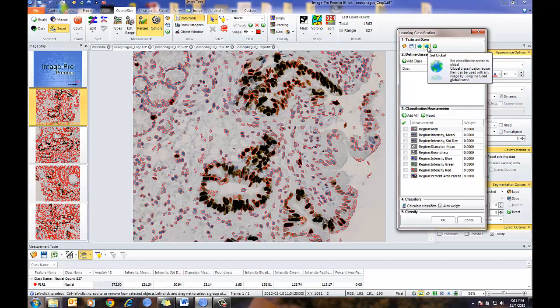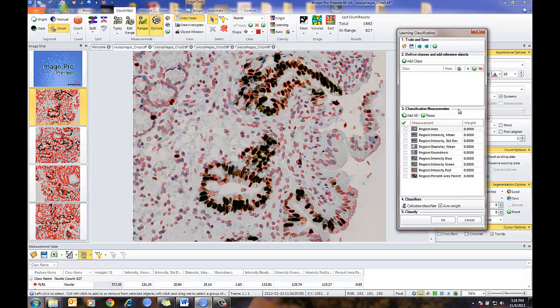If you don't have all the representative groupings in any particular image — which is common — we can refine and build that classification and then apply it to multiple images. Here I have Reset. In the second grouping, I have Add Classes, where I can create my classes and set my reference objects for each class. Classification measurements — these measurement parameters are coming from Count Size. If there are parameters I want to use that I haven't set, I can always go back into Count Size, select Types, and they will automatically update and show up here.